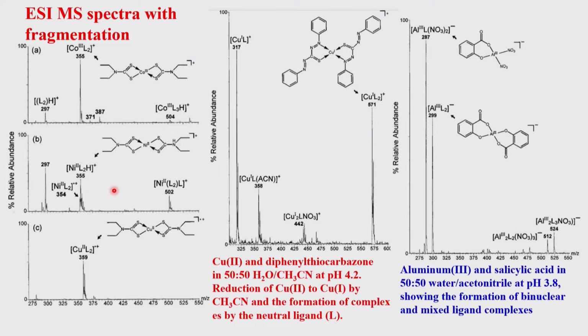That is the one, and the ligand itself is the one which you can see, that is again L2H, the dimer of the ligand, the 2 ligands together, and that is also seen as greater. So, compared to the cobalt species, the nickel species is not as high in intensity with respect to the free ligand. That is the nature of the complex which I was telling about. The currents will be dependent on the nature of the species as well.